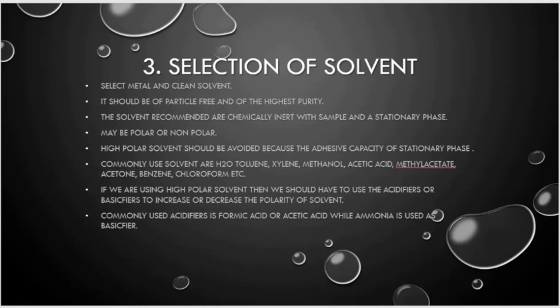The solvents recommended are chemically inert with the sample and the stationary phase, and may be polar or non-polar. Highly polar solvents should be avoided because the adhesive capacity of the stationary phase will be greater, and then it will damage our results.